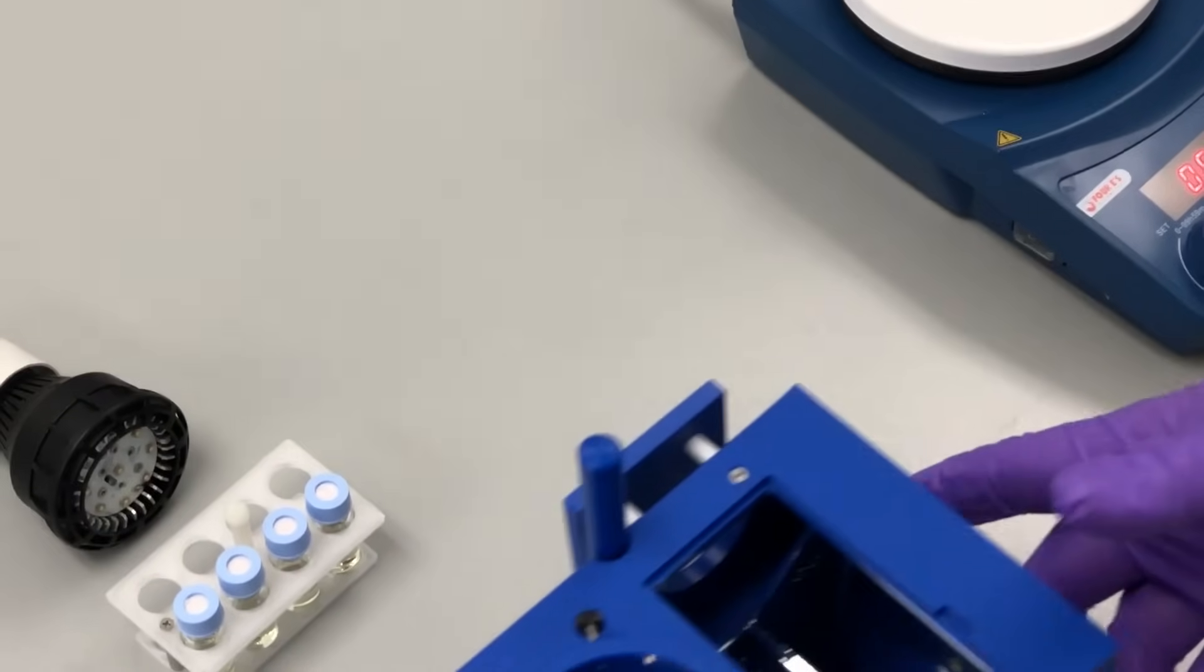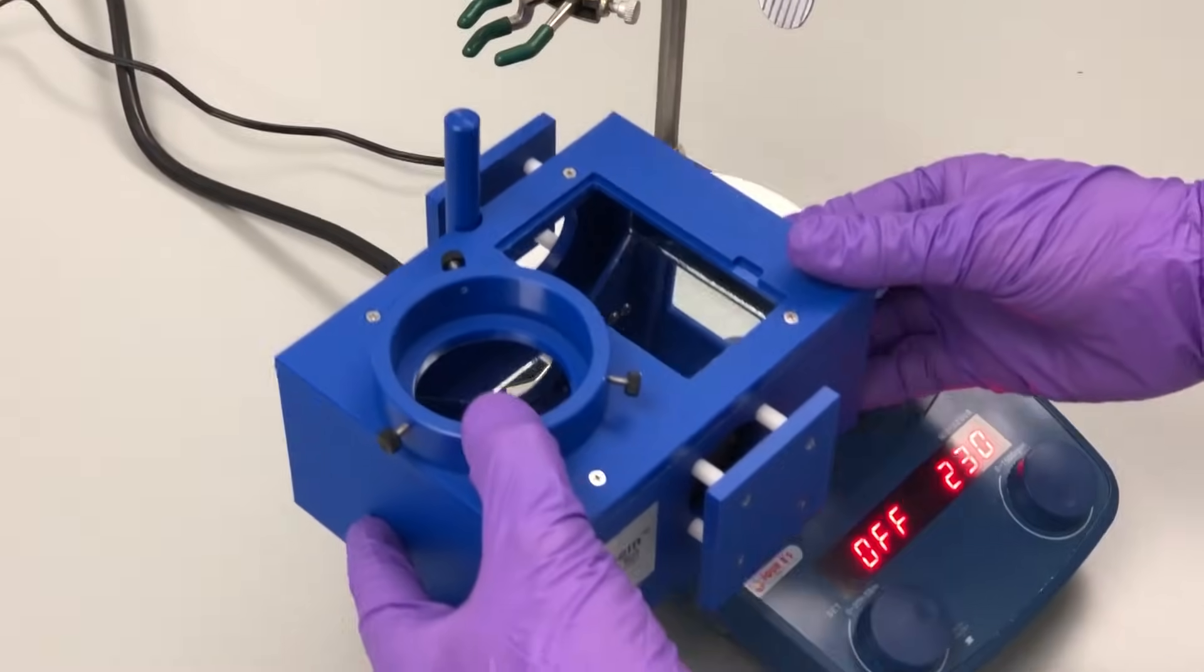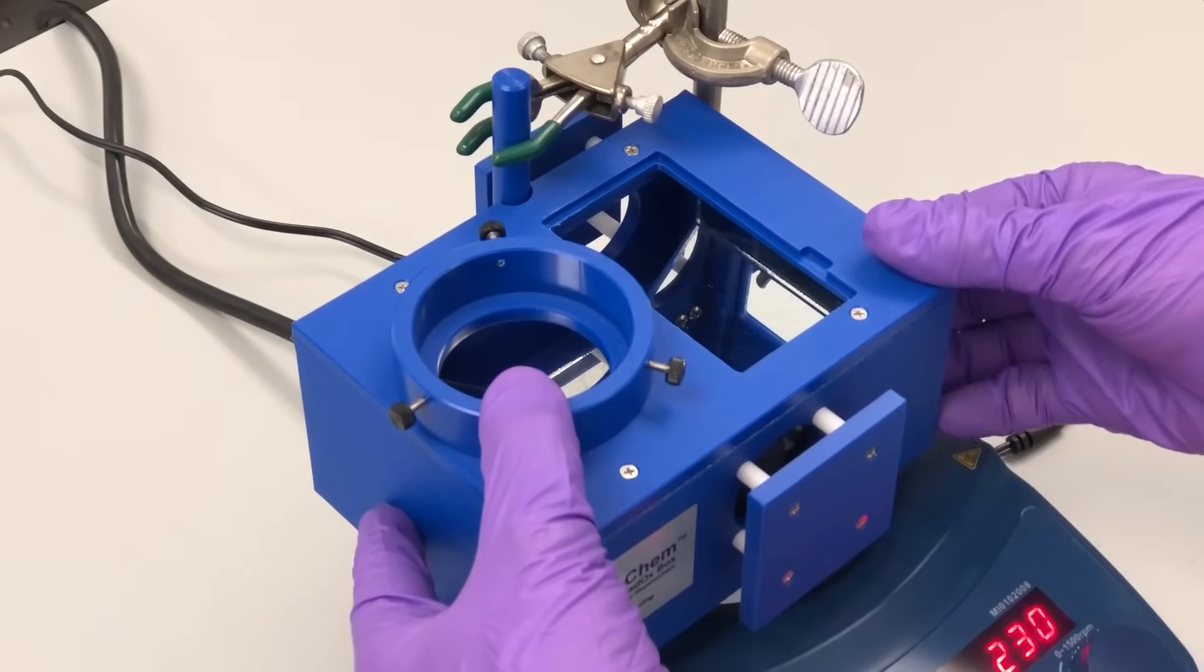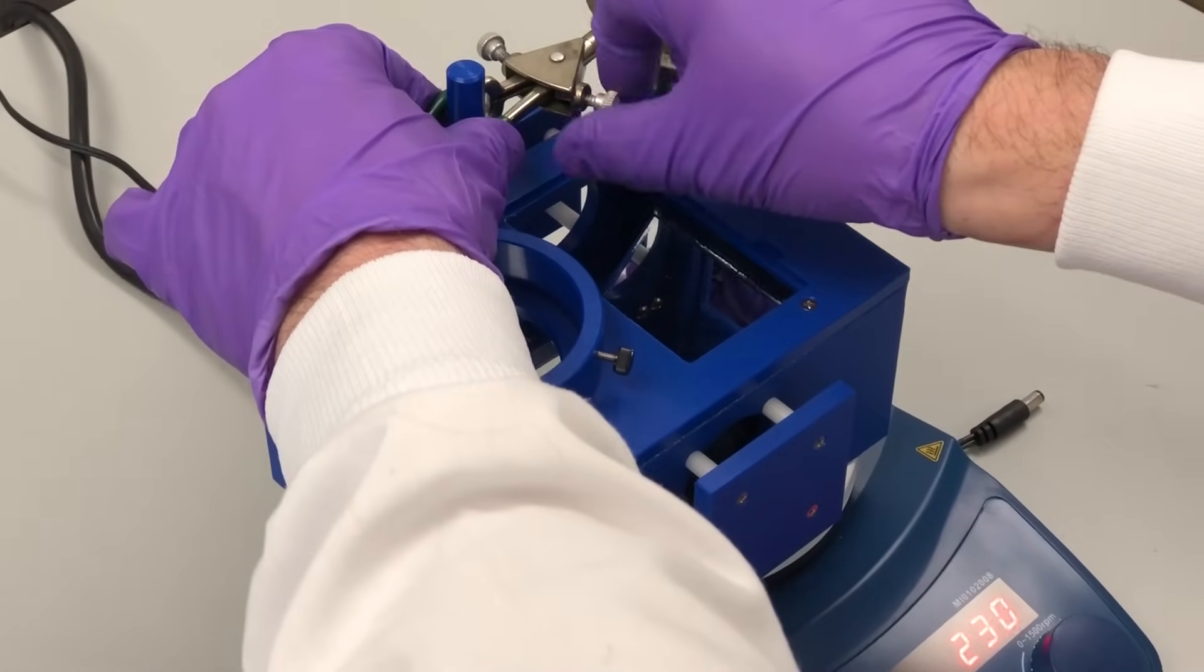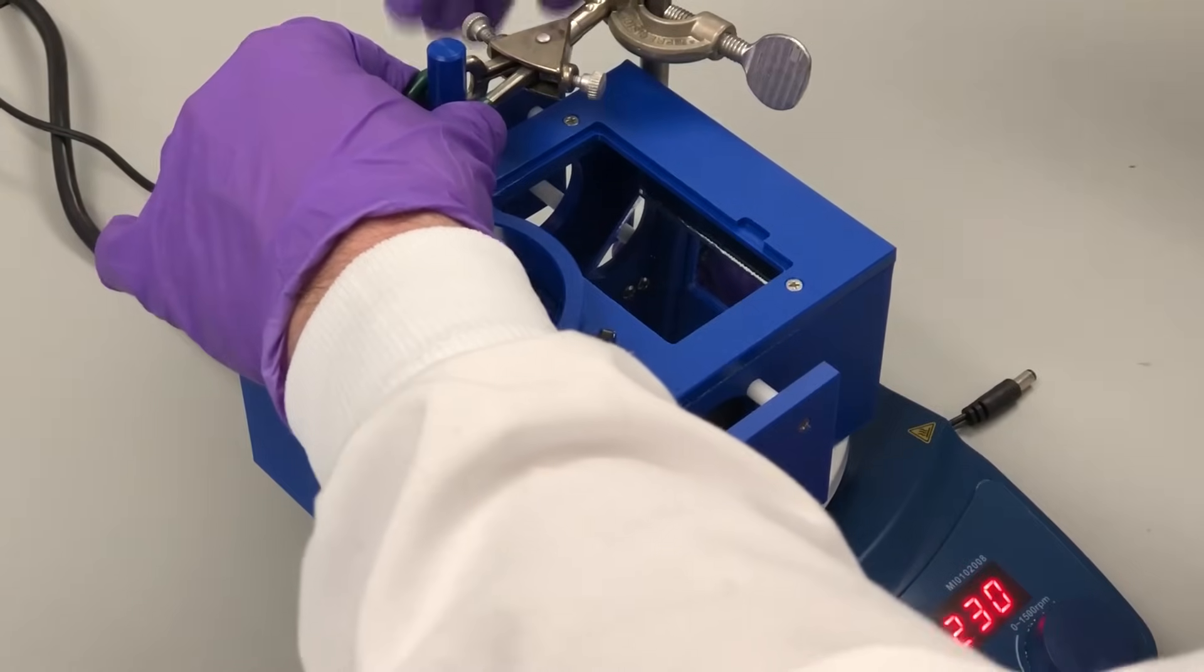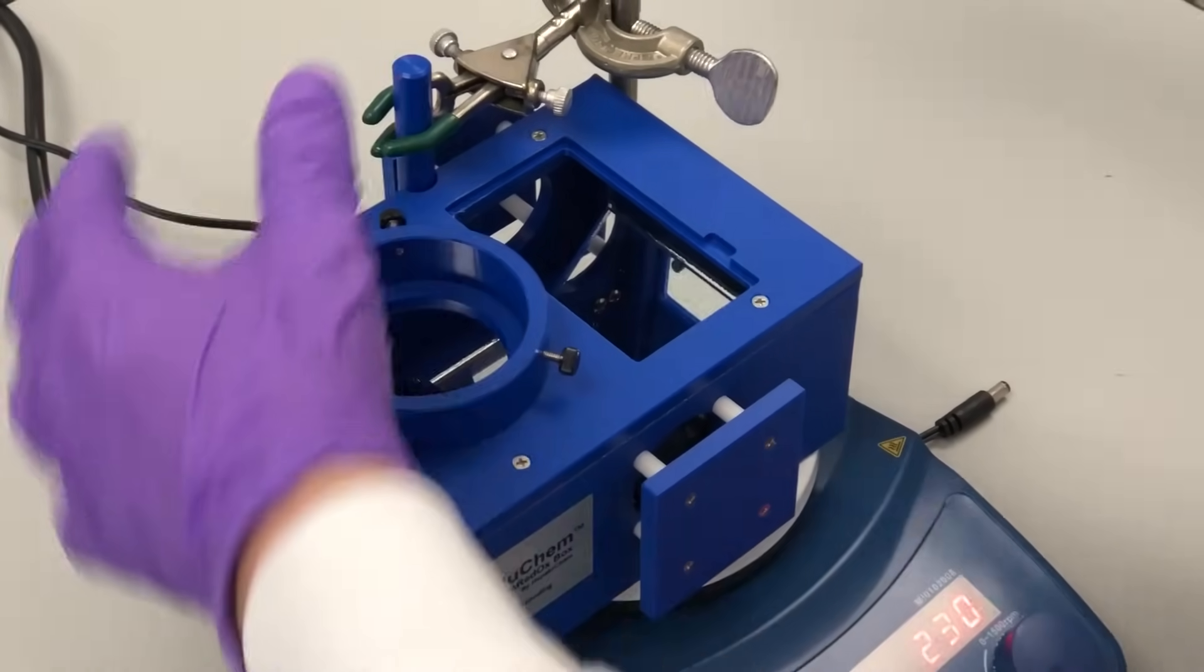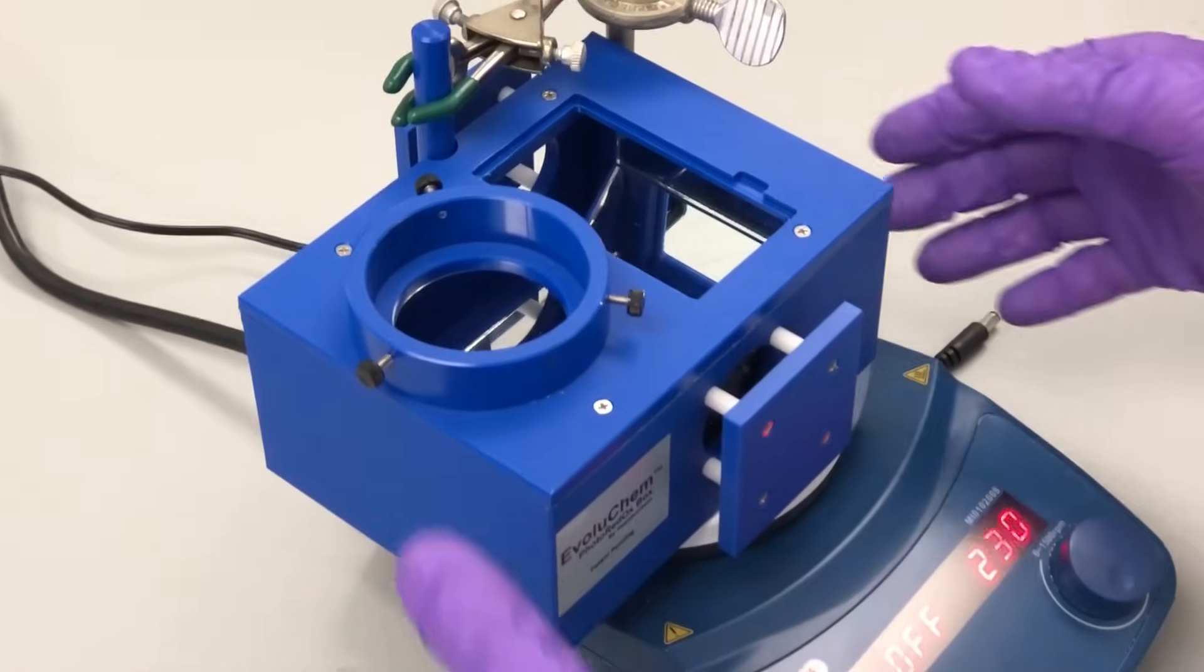EvoluChem photoreactors are designed for quick setup and easy operation. Each model comes with an integrated mounting stand that is compatible with most stirring plates allowing the reaction vials to be engaged by the stirring plate while securing the photoreactor.